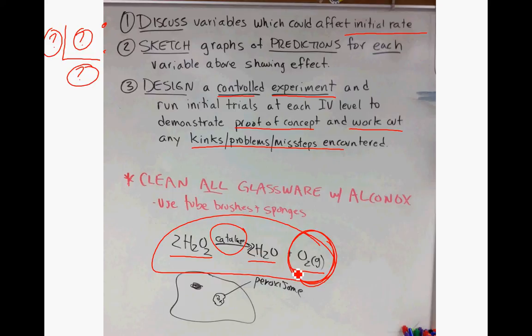So on the computers, you're going to be measuring the pressure changes over time. So you're going to be getting some sort of line like this, and again, then you need to take the slope of this best fit line and then plot that later on. So you're going to get lots of lines like that on the graphs. Okay.